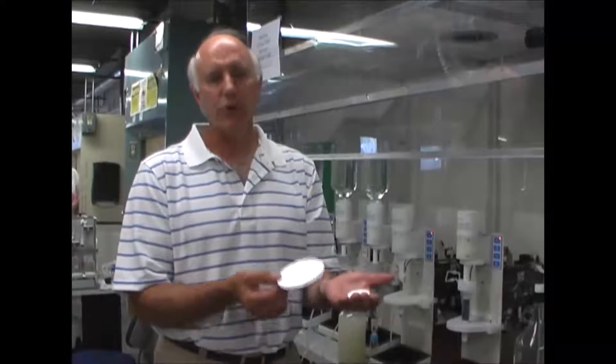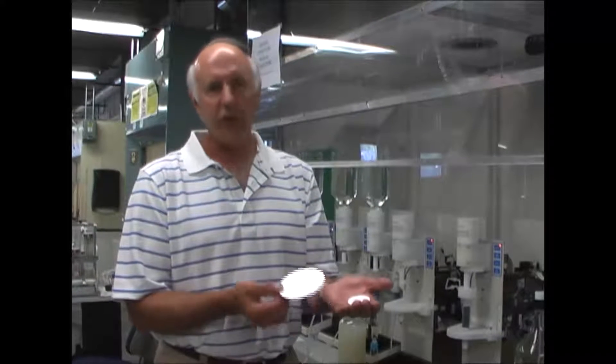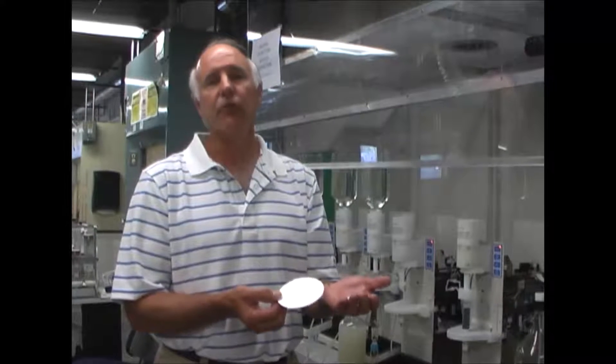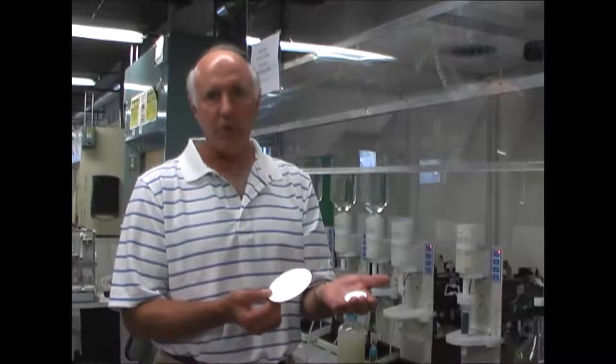The problem is that when you use a larger disc that has packing material, the cost of this disc can be four to five times greater. So there's not an economic advantage of using a bigger disc.